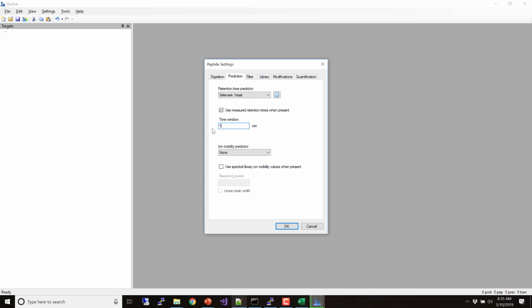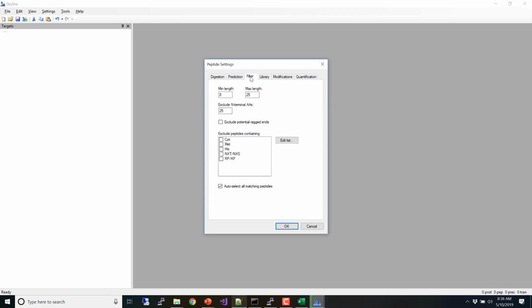And we'll go ahead and say 10 here, even though it's not important, because we're going for a 10-minute window extraction. On the filter tab, we're going to go 7 to 45 and use 0. And this again gets me as close as possible to what was used in the paper. So last time we allowed 6s. This time we're a little bit more restrictive, but not hugely more. And we don't go up to 20. We don't go up to 55.